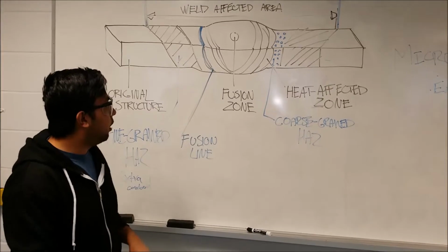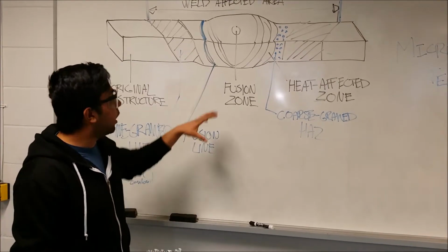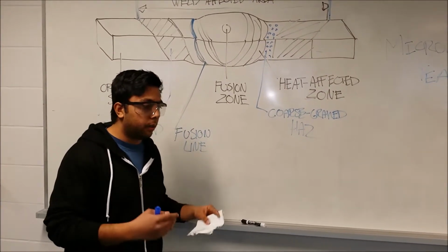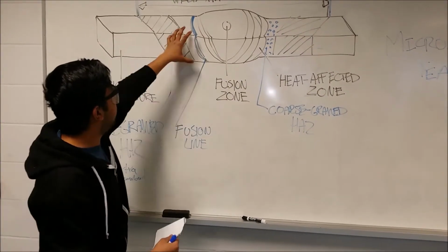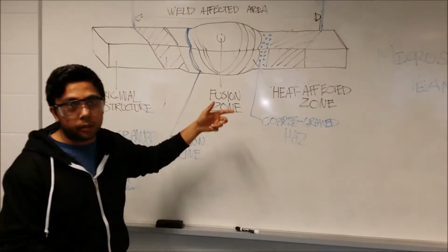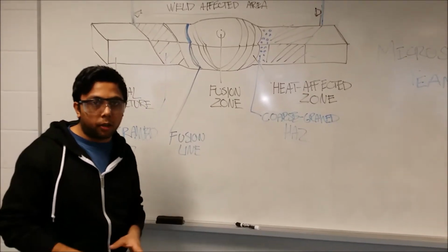Before we begin, I'd like to talk to you more about how the process of welding actually takes place. Welding is just a fusion of two materials or samples, in this case steel with each other. By using high heat, we melt the steel and then we fuse it with the other part of this sample. In this case, you can see this area right here is actually a welded part, with another steel with variable amounts of carbon.